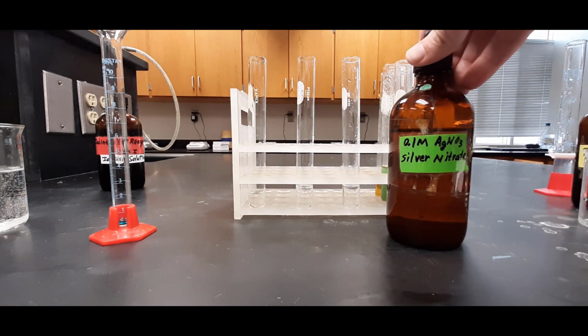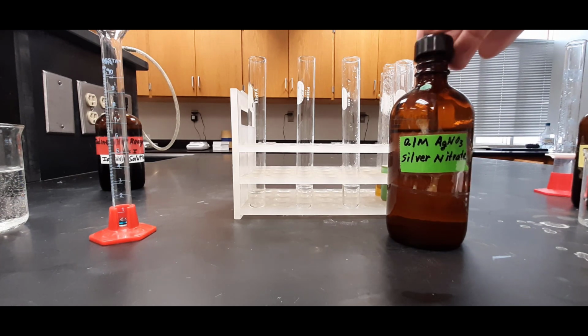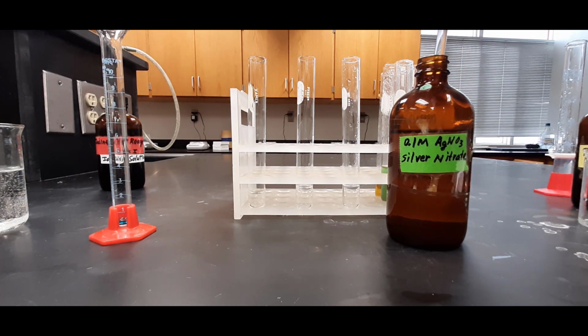I will now test the filtrate for each of the three possible solutes, beginning with the chloride ion. Here, I carry out the test for chloride using the silver solution.